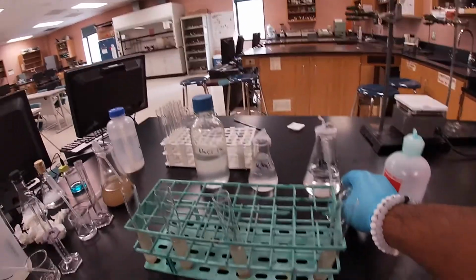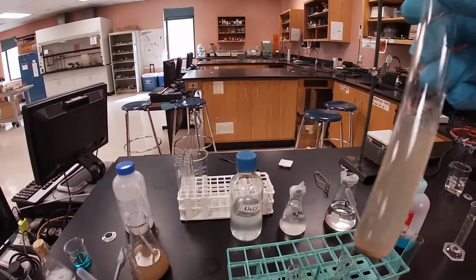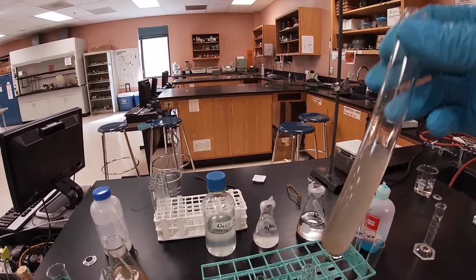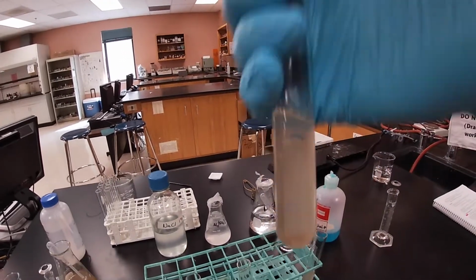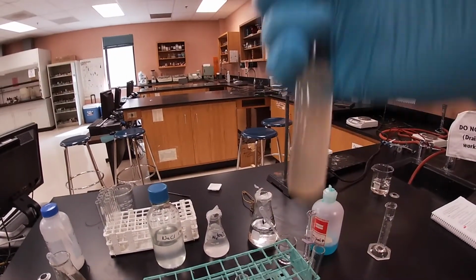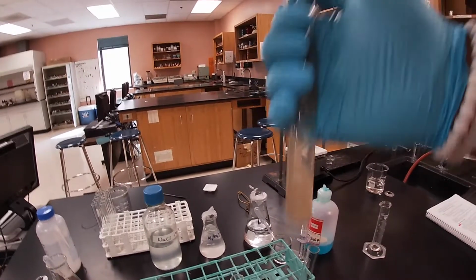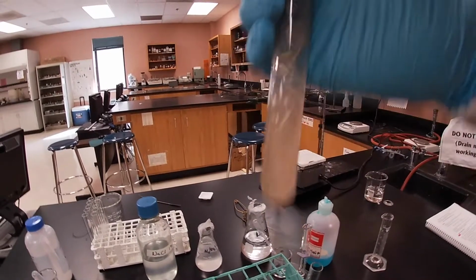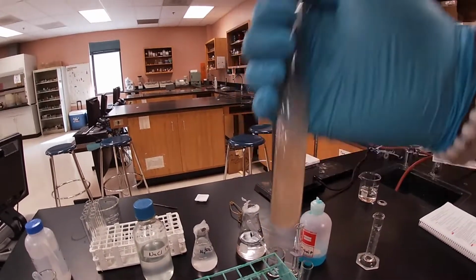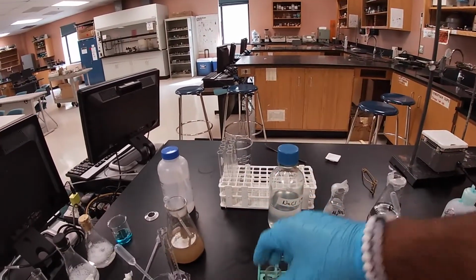Now we'll go ahead and do what we said we were about to do. Go ahead and shake. All right. Make sure we shake our test tubes thoroughly. We're gonna do this for all of them. So that's the water one.